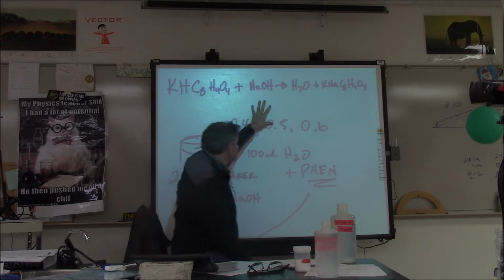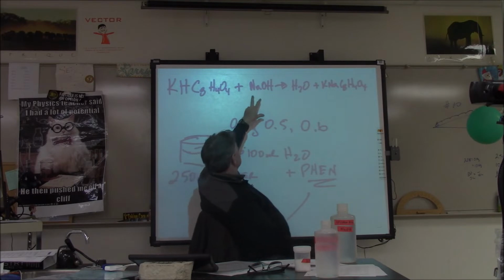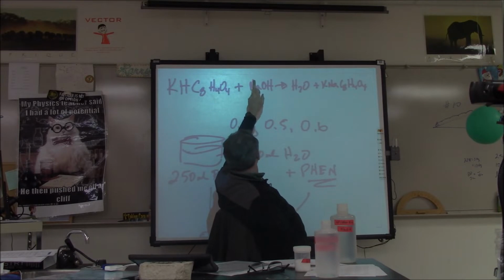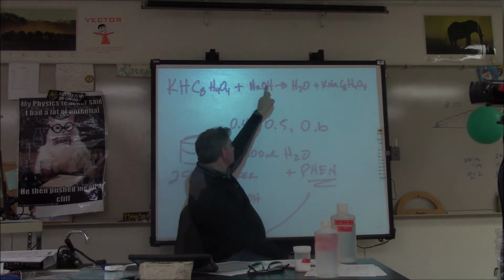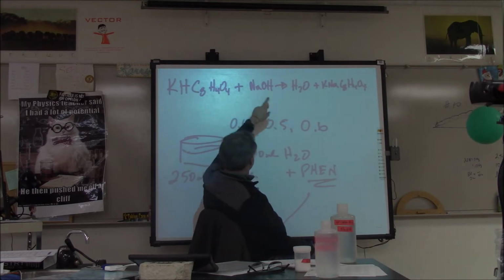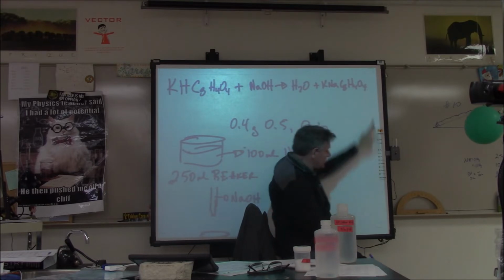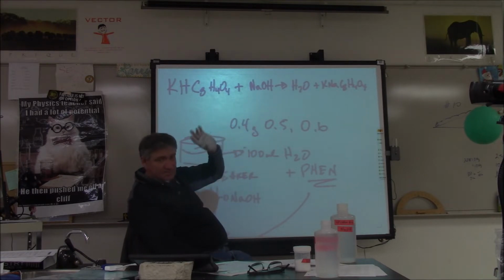This is going to react with sodium hydroxide, and basically it's a really complex double displacement reaction. That's aqueous sodium hydroxide. The sodium is going to come in here and kick out the hydrogen. When it kicks out that hydrogen, it's going to bond with that remaining OH and produce water. Then as that gets kicked out, that sodium takes its place, so you get this complex ion over here. But here's what's important: everything is in a 1-to-1 ratio, so the stoichiometry is going to be easy.